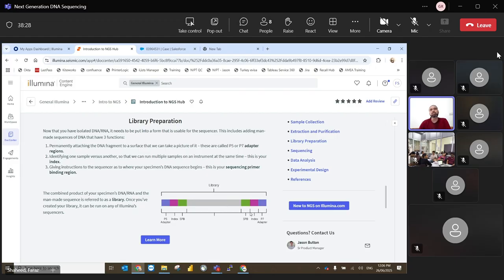There is another QC that you might not have heard about, which is the bioanalyzer. You know how much quantity of DNA you have, but do you know how much quantity there is for 300 base fragments? How much for 400 base sequences? How much for 500 bases? Because based on that, it will bind onto the flow cell. Smaller fragments easily hybridize to the complementary sequence, because longer fragments, as you can assume, will be lazier. Longer fragments need more energy to hybridize onto the flow cell for sequencing.